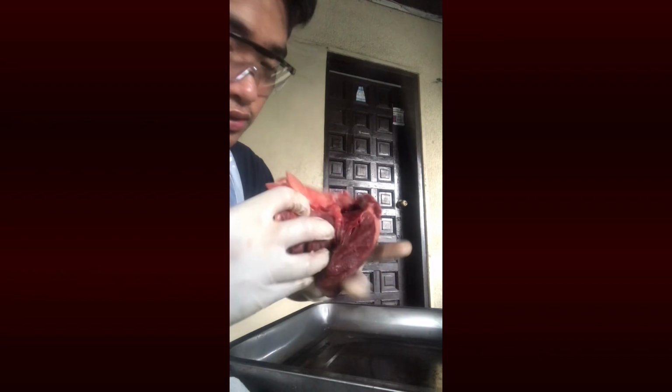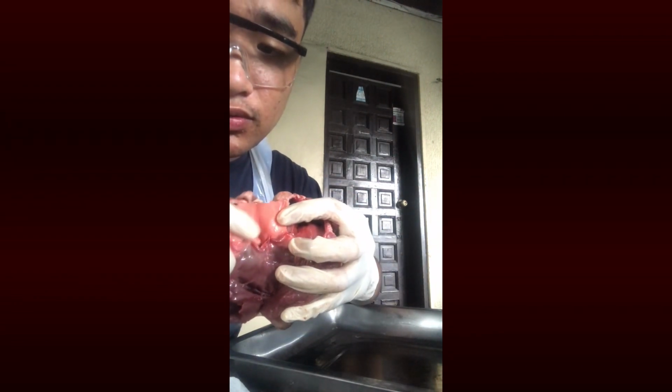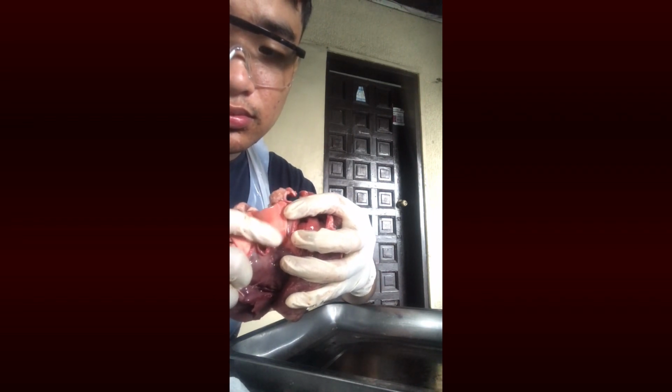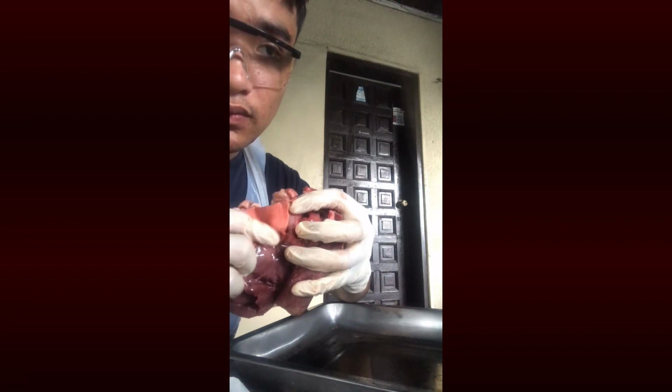Count the 3 flaps or leaflets on this valve, leading from the left ventricle into the aorta, and note their half-moon shape. This is called the aortic valve.